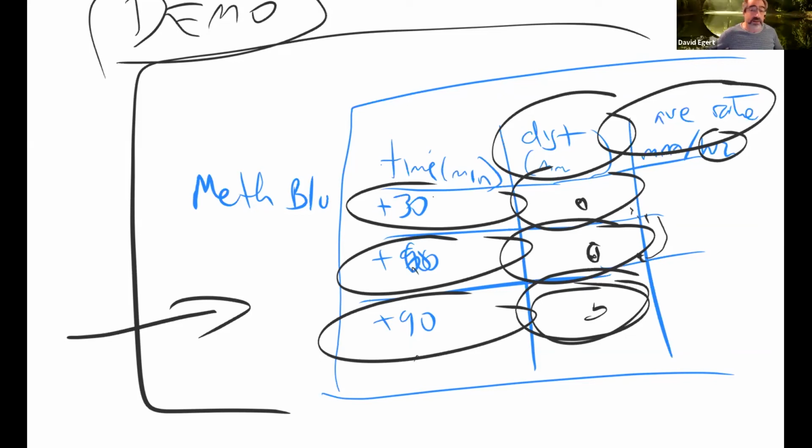I think the next lab is also just continuing these ideas of osmolarity and osmosis, except looking at actual living cells. We have 10 minutes here, so I'm going to discuss briefly a little background on the terminology that you'll need, and also give you the core ideas you need to think about to develop your hypotheses, because you actually do need to have an objective and a hypothesis for Tuesday.